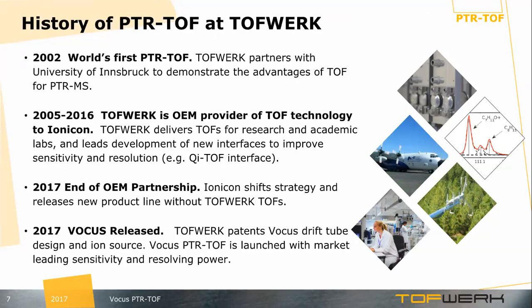A little bit of history about the PTR-TOF at Tofwerk. In 2002, the world's first PTR-TOF was put together with the University of Innsbruck. This coupled a Tofwerk time-of-flight mass spectrometer with the drift tube developed at the University of Innsbruck. Shortly thereafter, Tofwerk and Ionicon became partners in delivering PTR-TOFs around the world.